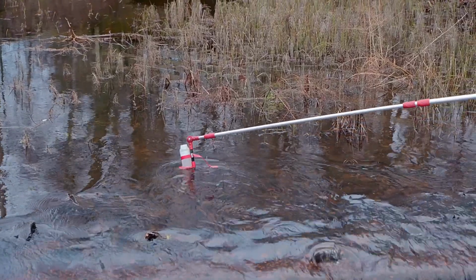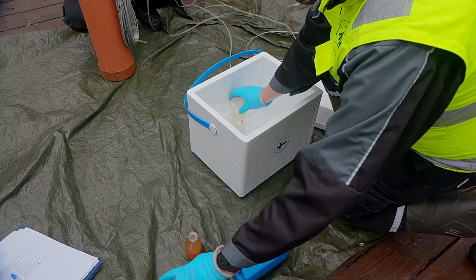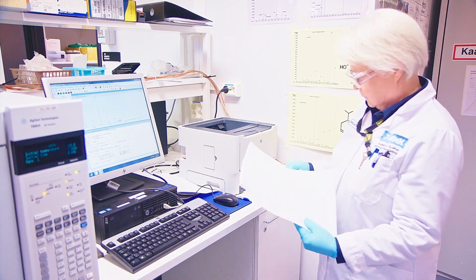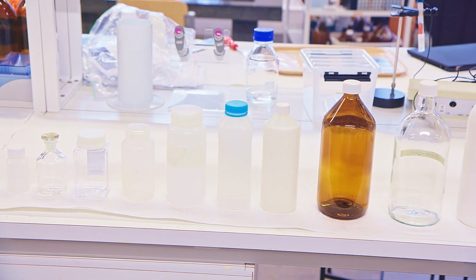Water is taken from the desired point and sent to a laboratory for analysis. The laboratory can analyze almost anything from water samples according to the needs. What is analyzed from the samples may affect, for instance, the sampling depth, the material of the sample container, and how the container is filled.